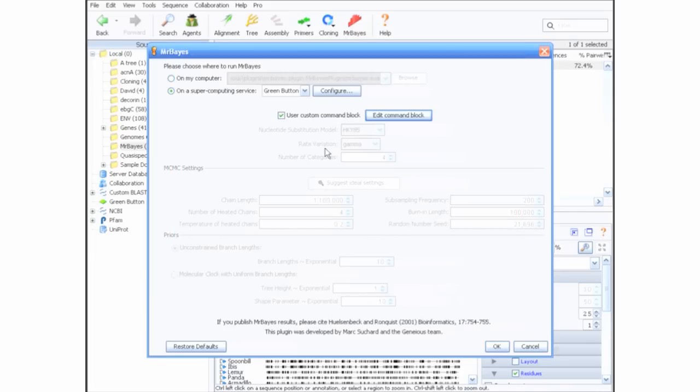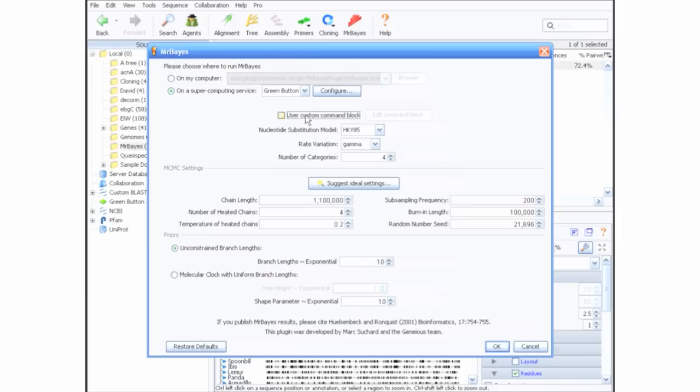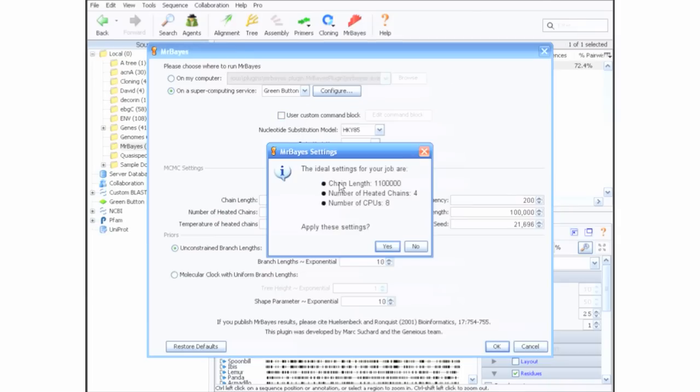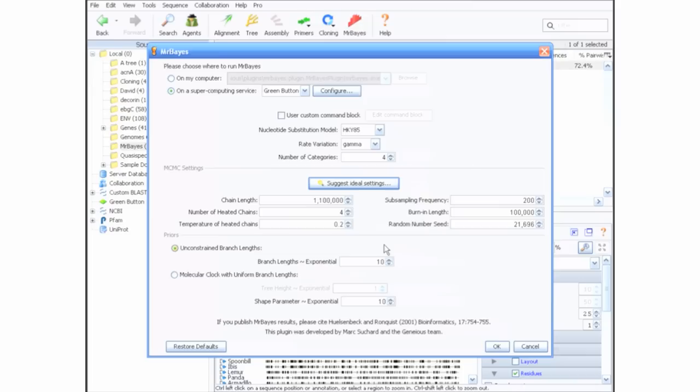Finally, the Suggest Settings button will recommend good settings for your job, including the correct number of CPUs. Click the OK button to start your job.